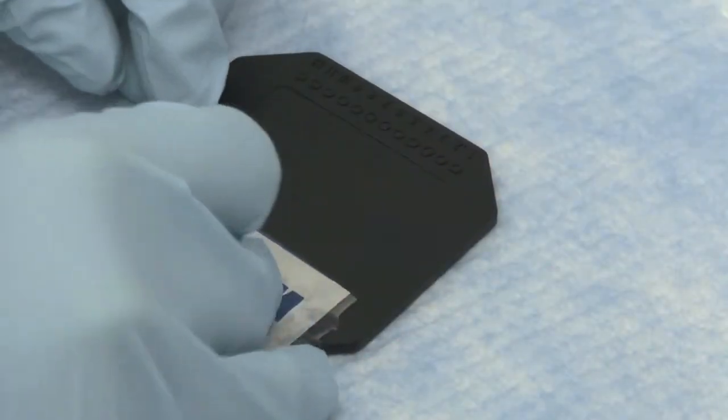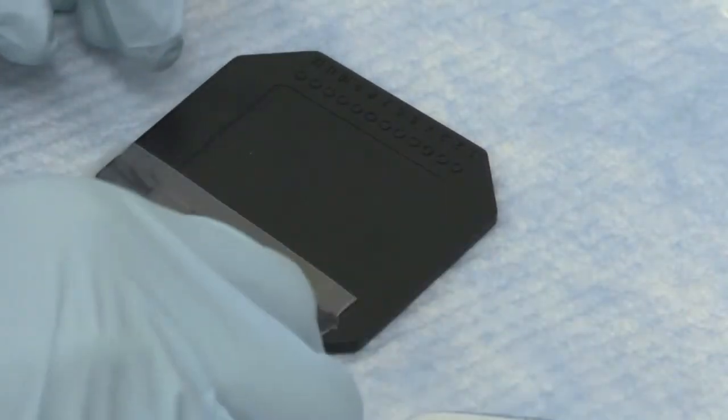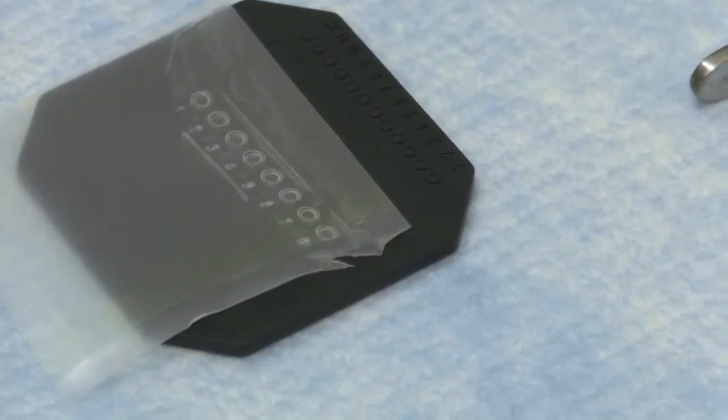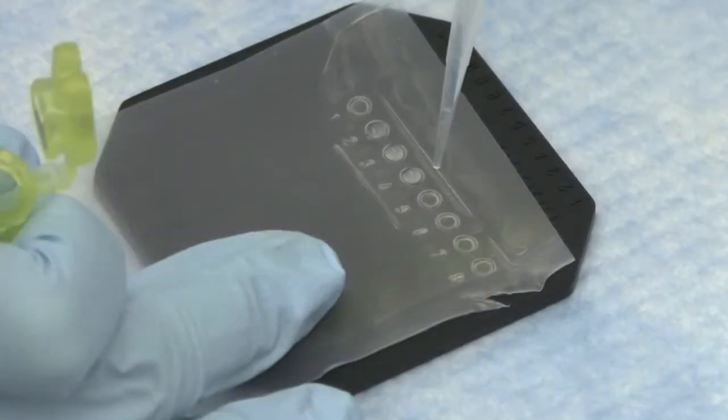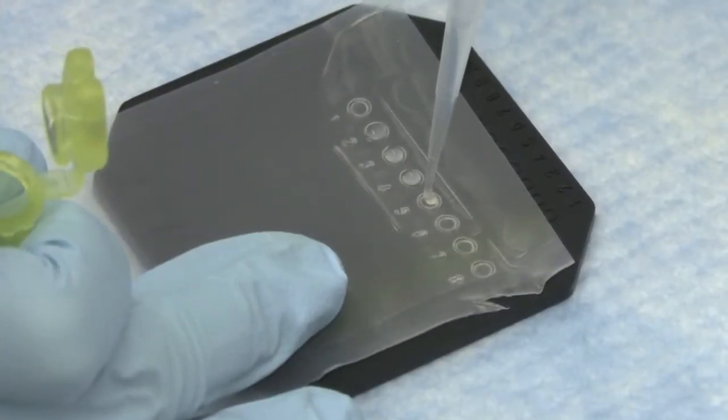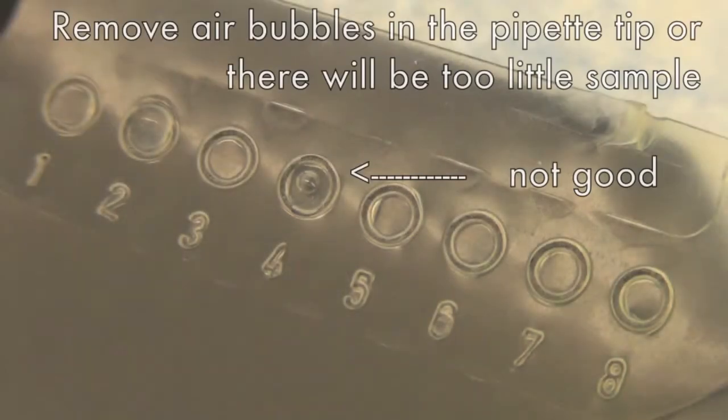Remove the white piece of the parafilm on the sample holder. Start loading samples and the marker onto the sample holder with a pipet set at 5 microliters. Record which sample you have put in which lane. Make sure no air bubbles are observed, otherwise in the next step you may not obtain the proper amount of sample.